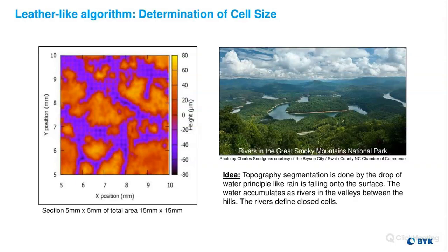And so we can then take each of those cells and calculate our cell size, our total cell area across the entire measurement, and then our total cell size with that.